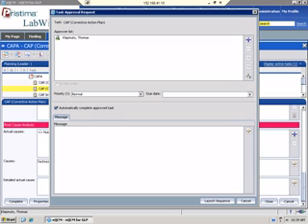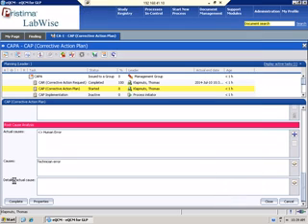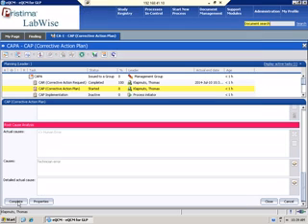And again, the system will send notifications as you get closer to the due date. So you can have it send notifications 15 minutes, day before, at the due date, and then every 20 minutes after. It's past due every day, once a week. And then you can also put in a message. So that's going to send an approval.